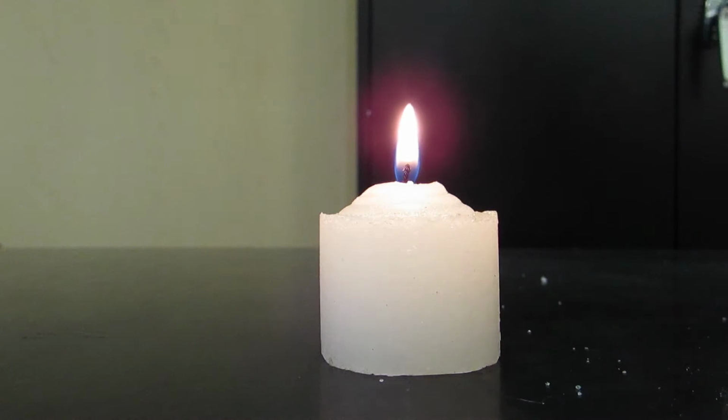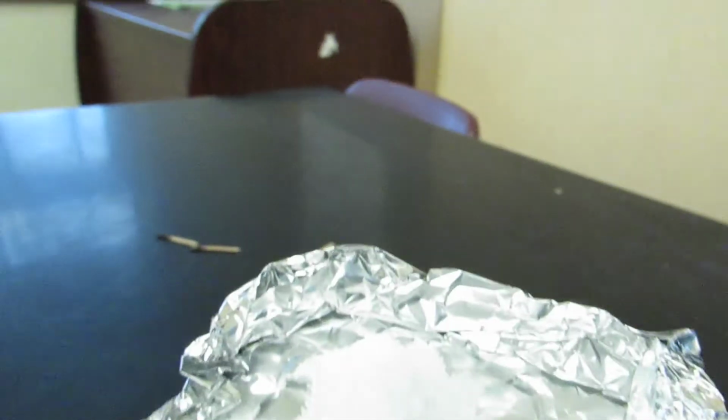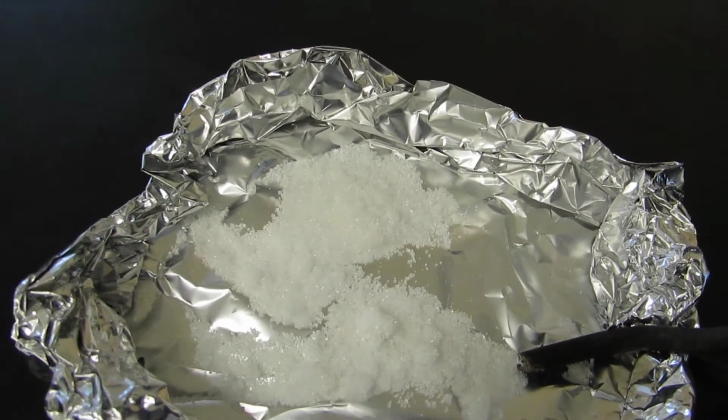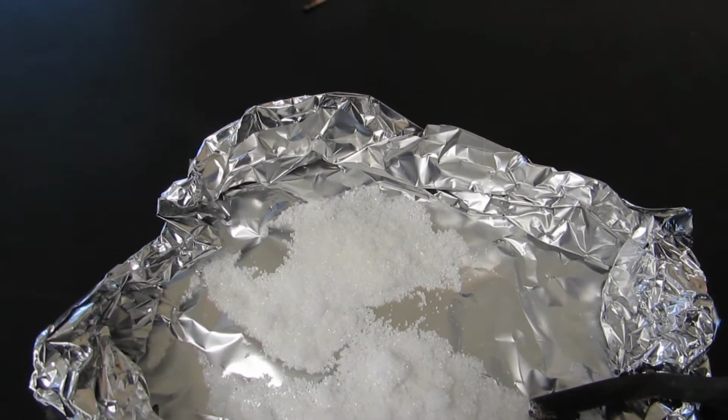The third experiment, we are going to light our candle once again. We're going to take some sugar and put it in a tin foil kind of like plate, and we're going to heat it up to see what happens. So take a good look at what happens.